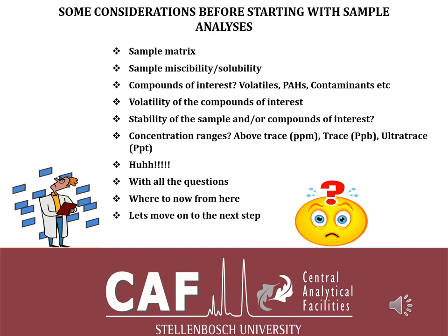Also, the injection mode that you can use is splitless injection, but when you're doing the ppm range, splitless might be too high. You will definitely have to use a split injection. We'll also explain the difference between split and splitless, and there's an example of how to calculate the split ratio, how much of the injection you're making.